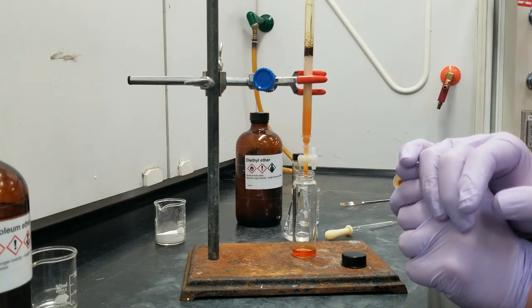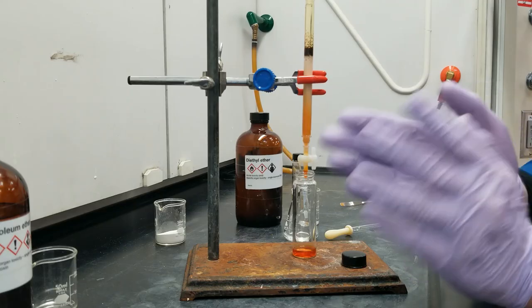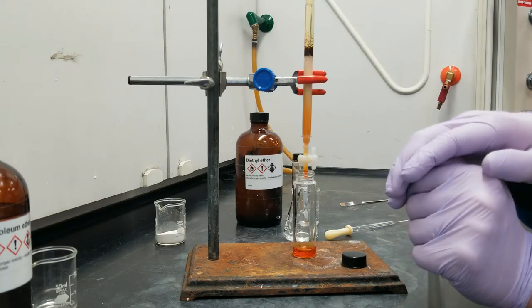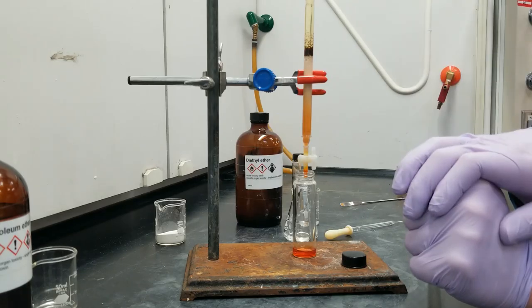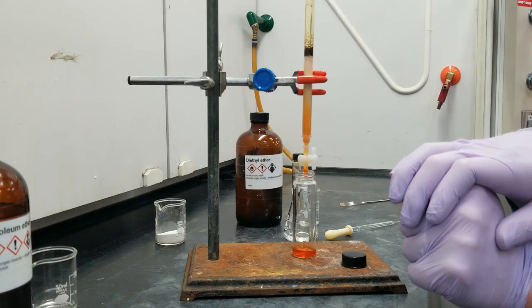For the purposes of this lab, we're not using any solvents that could really remove this from the system, and it's not a product that we are trying to collect anyway. So we're just going to leave it to hang out at the top.